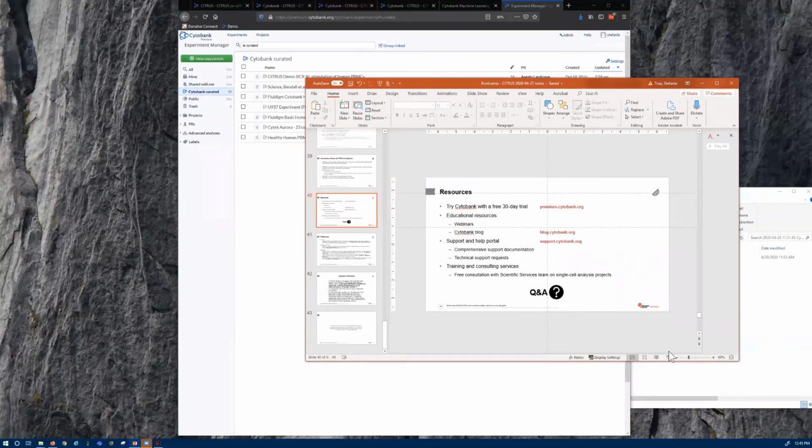Okay, another question. This is basically a clarification question. Is Citrus a similar model to tSNE, but instead it identifies populations in a more enhanced or different way, such that it gives you additional or different information about the population of interest? Chi-Hao, is that the case?